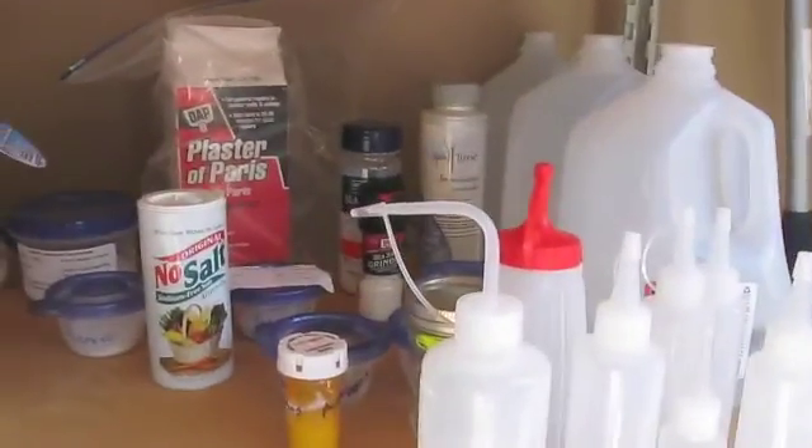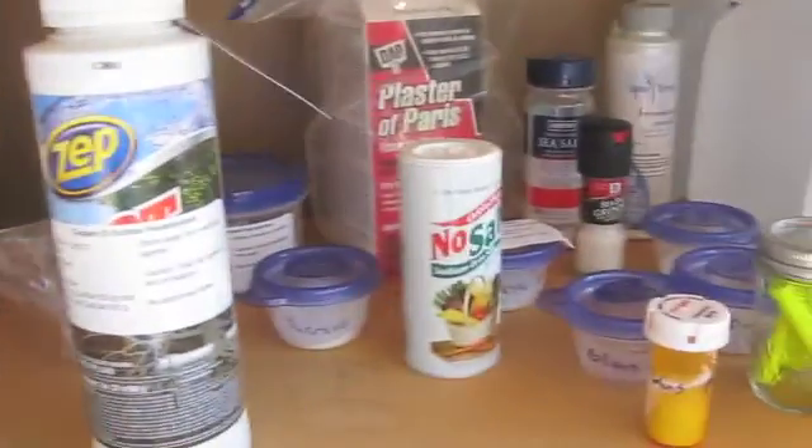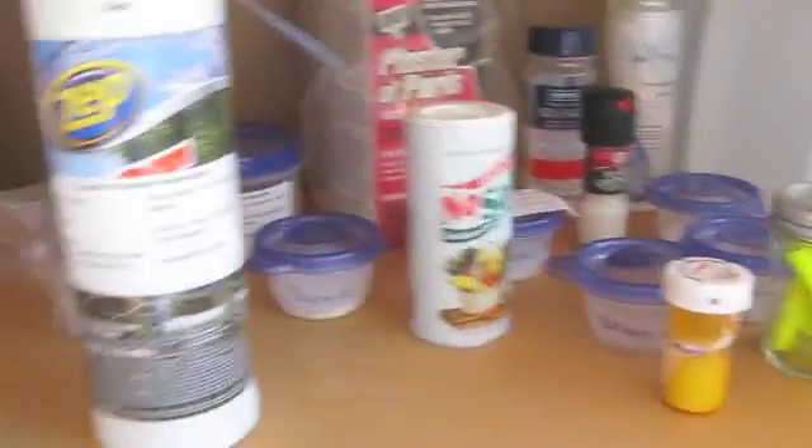On this shelf, I have less hazardous substances like water, mineral oil, and table salt. There are a few more hazardous things like copper sulfate and calcium chloride, but this is generally less reactive and less hazardous stuff.